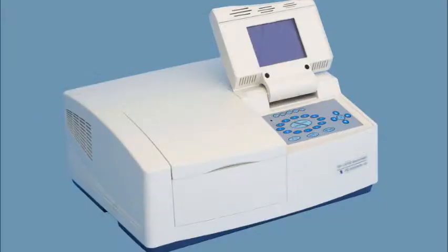Ultraviolet and visible spectrometers have been in general use for the last 35 years, and over this period have become the most important analytical instrument in a modern-day laboratory. In many applications, other techniques could be employed, but none rival UV-visible spectrometry for its simplicity, versatility, speed, accuracy, and cost-effectiveness.